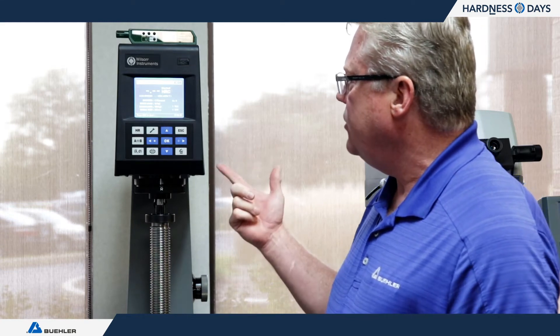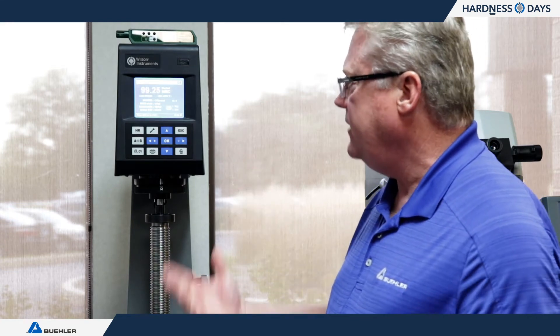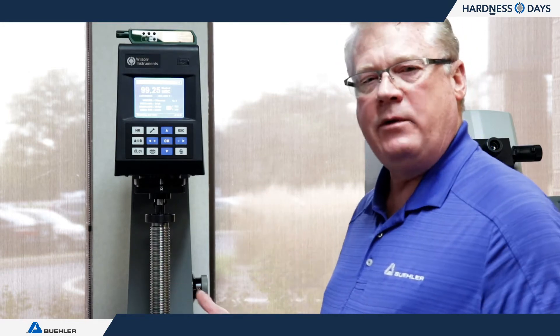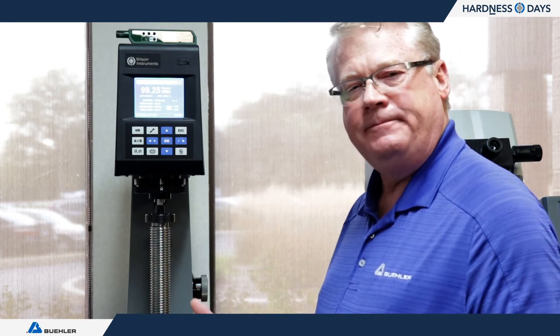Now the second reading starts to approach 99 — we're at 99.25. So this machine would be compliant, although I would capture the last of the eight readings.